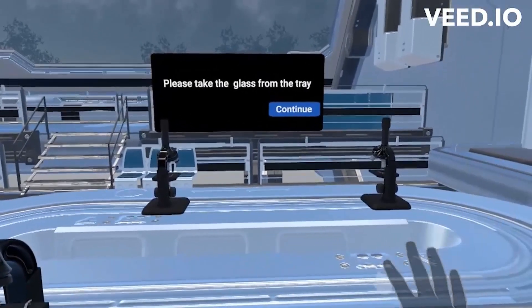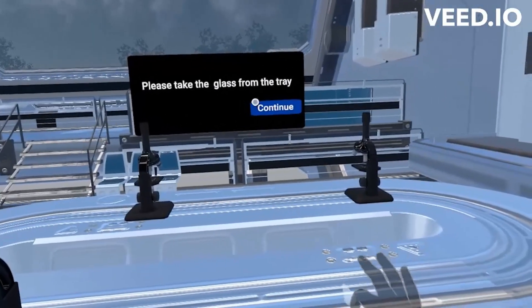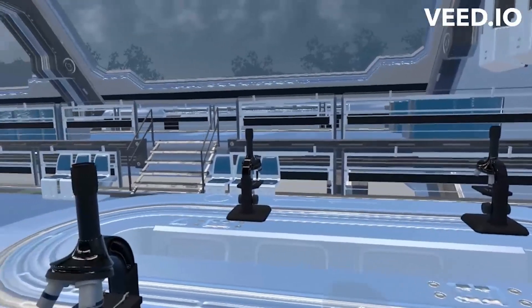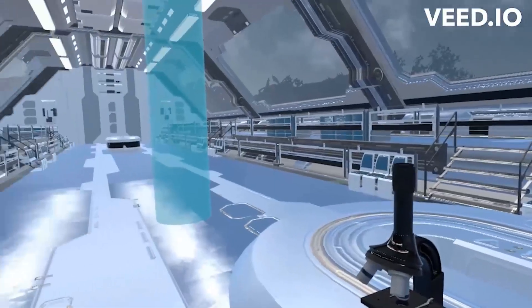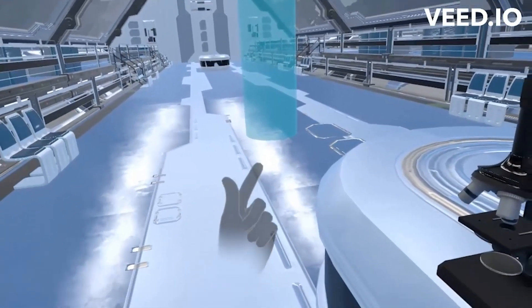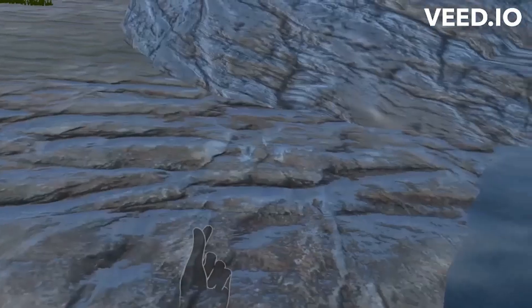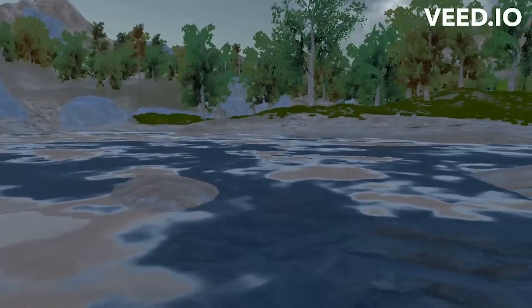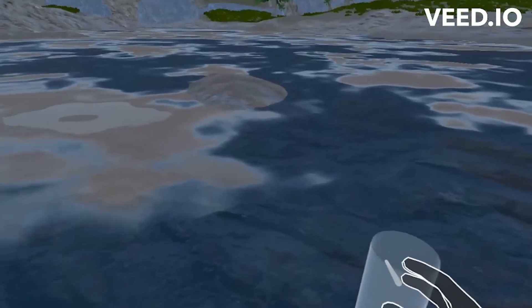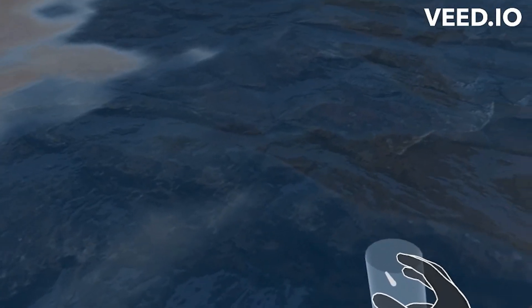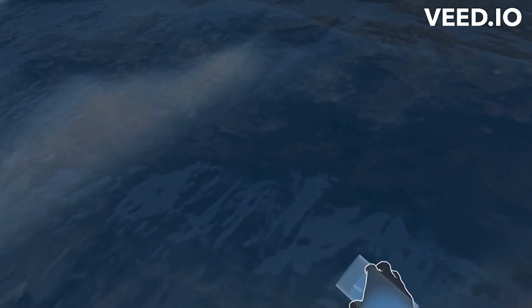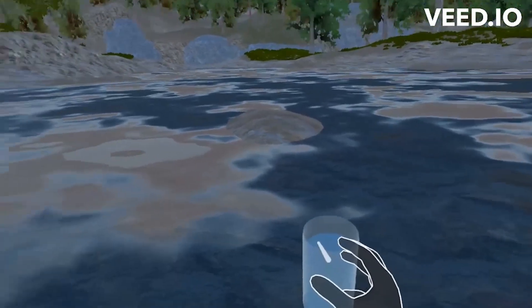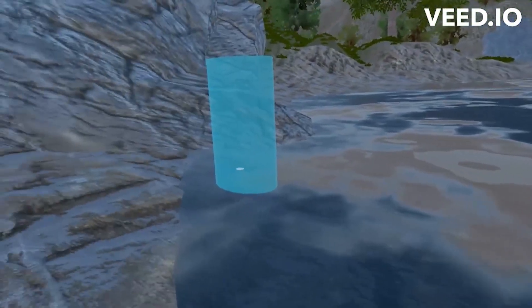Please take the glass from the table. Please move to the highlighted area to collect pond water. Please take the pond water. Please move to the highlighted area to get inside the workstation.